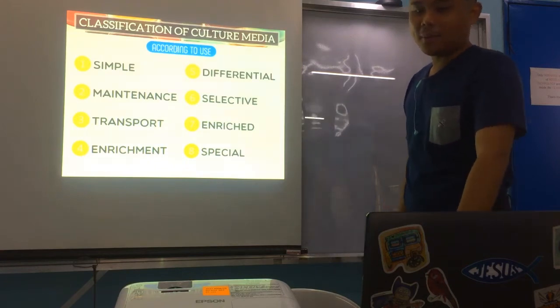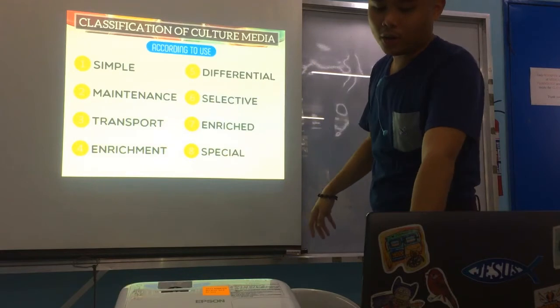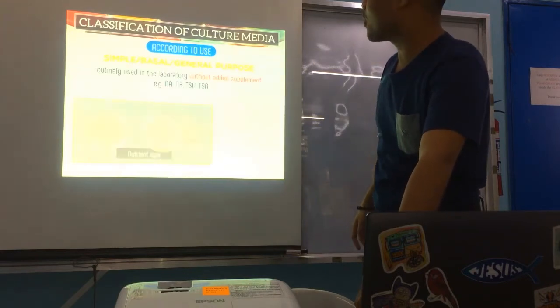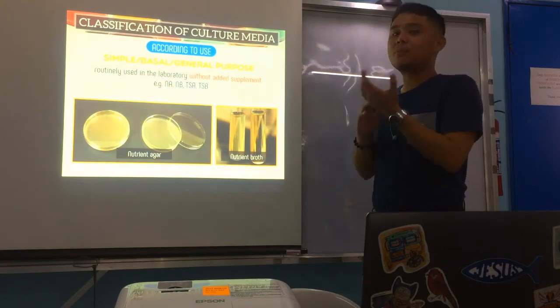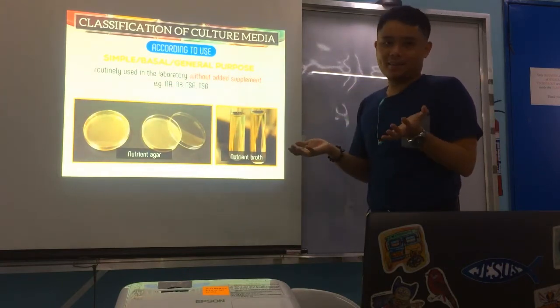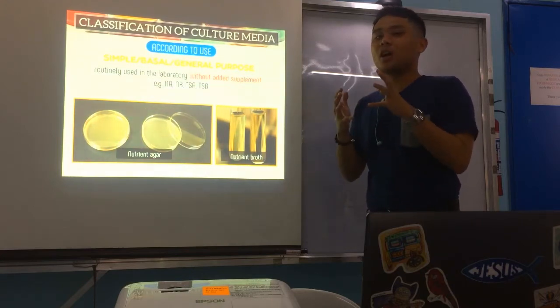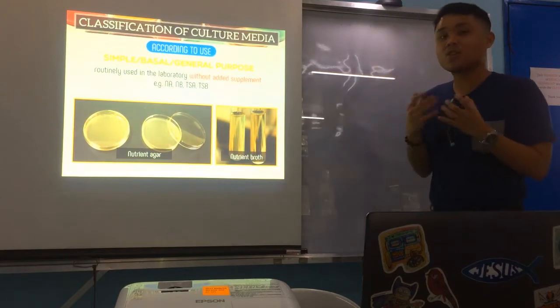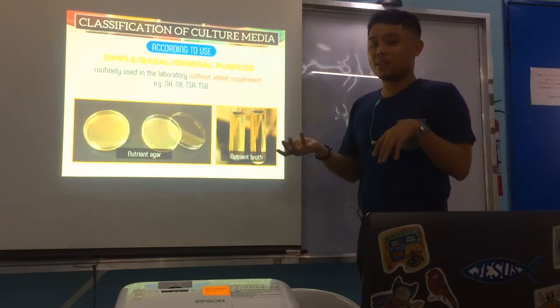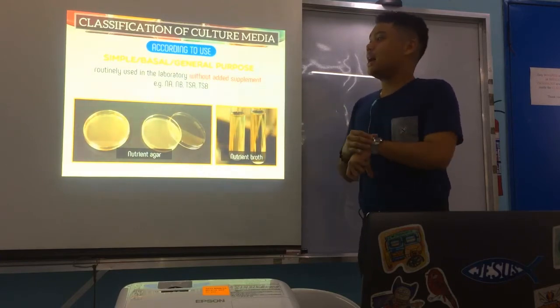So, this is, again, we'll start now with the different types of cultural media according to use. First is, of course, you have simple, basal, or general. By the definition itself, it is simple. Basically, it's just plain. Okay. Basically, it is used for routine use, and it can support the growth of many organisms, even both gram-positive and gram-negative. And usually, fungi can also grow on it.